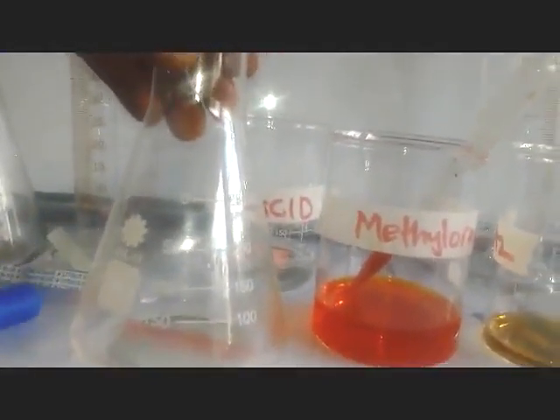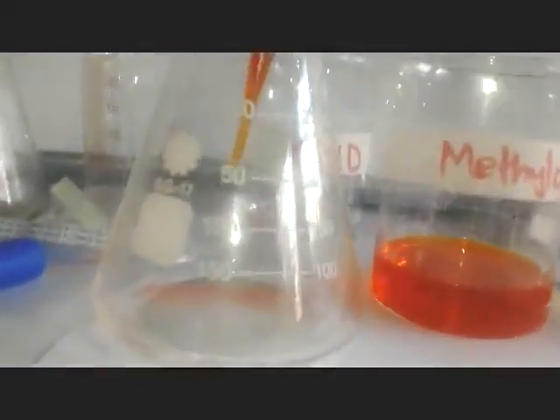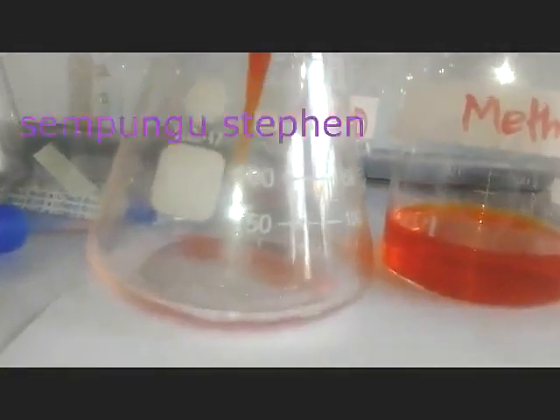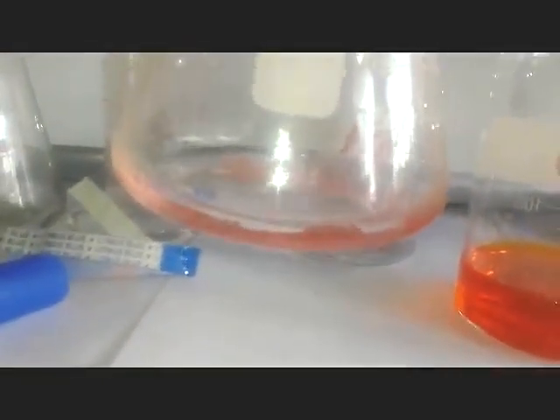Now this implies that this one is our acid. So let us put our methyl orange and see how it's going to behave. I'm going to put some drops. That is the first drop. And then I shake a bit. I can even add another drop. And then we see. When you add the second drop, you can see that the solution is turning red. You can see our red we are talking about.